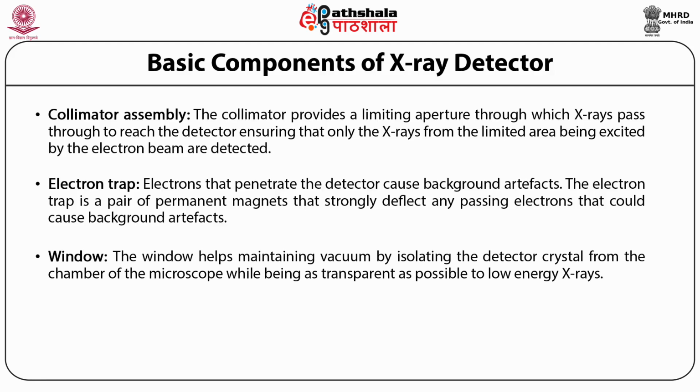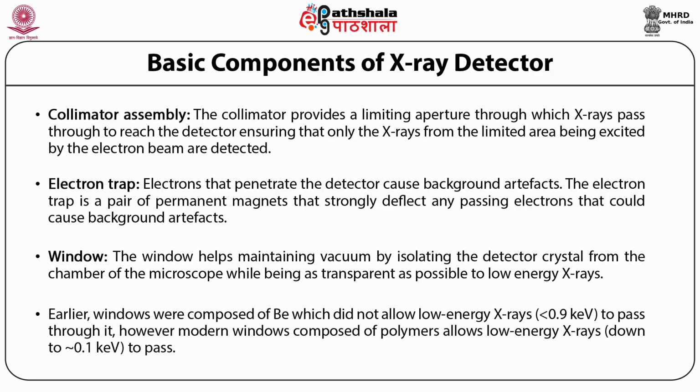Third, the window. The window helps maintain vacuum by isolating the detector crystal from the chamber of the microscope while being as transparent as possible to low energy X-rays.